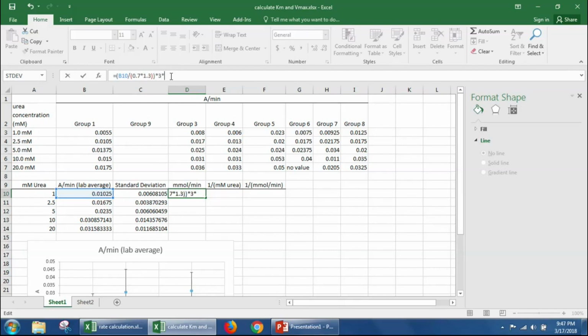And we also had a total reaction volume of 1.1 milliliters, and we only took out 0.2 milliliters at every time point. So we have 11 halves dilution. So these will be our two dilutions. They equal 16 and a half total.